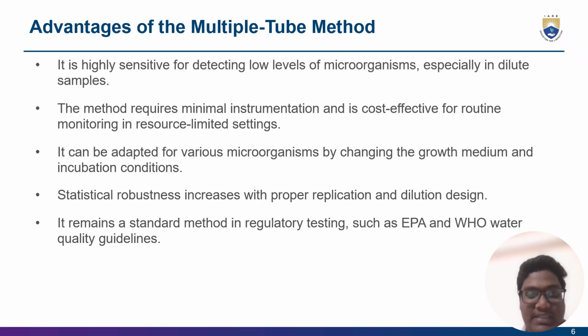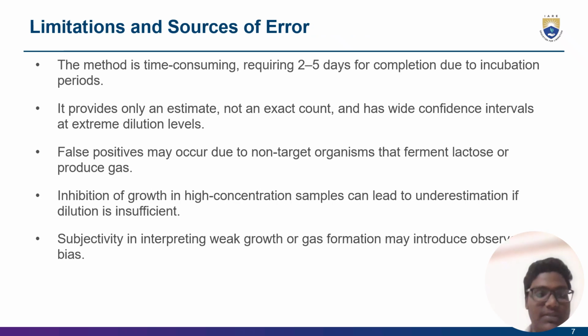Statistical robustness increases with proper replication and dilution design. It remains a standard method in regulatory testing, such as EPA and WHO water quality guidelines. And this is the advantage of the multiple tube method.